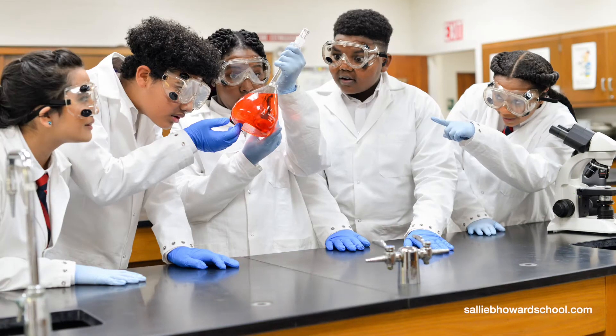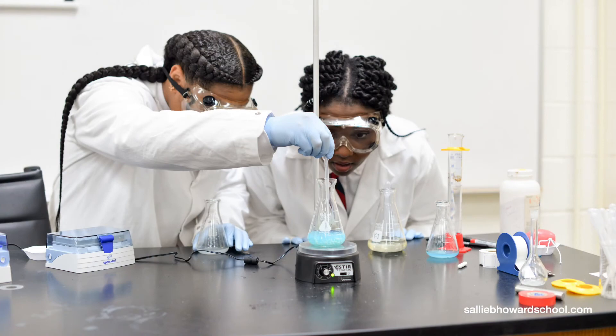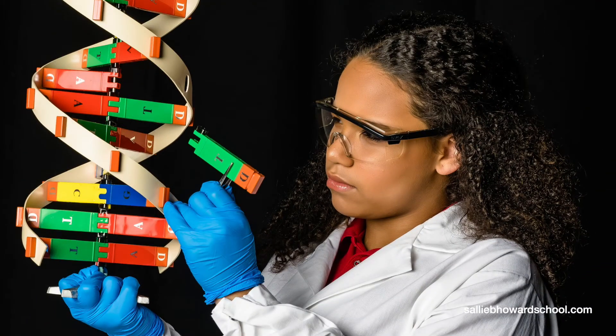The skills our biotech students gain in this high school program will qualify them to be a lab assistant at a local company, or maybe they'll pursue a two-year program at a local community college or a four-year degree at a university. There are several universities and community colleges that align directly with our biotech program. Biotechnology is about solving the world's problems — we have seven billion people and we need to figure out how to help them survive on the earth we have today, and biotech is the answer for that.